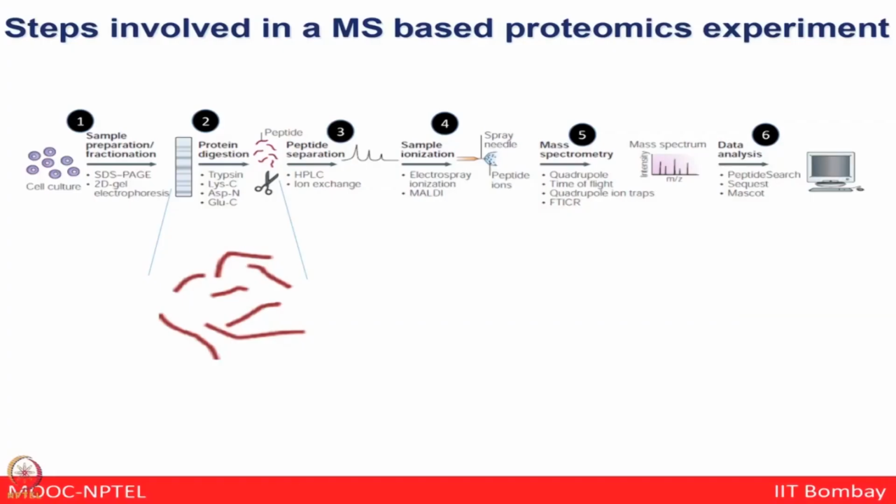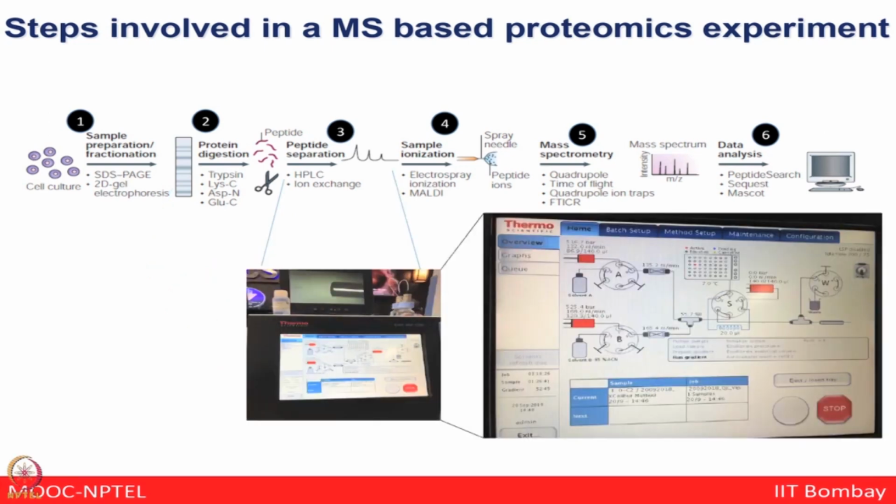You can use various types of enzymes like trypsin, Lys-C, and various other enzymes such as chymotrypsin, which could be helpful to do digestion of these proteins. Of course, doing good protein digestion is very crucial, so you need to use the right conditions for this enzymatic treatment to happen. Once you have done that, you want to separate the complex peptides based on different chromatographic properties, and that is where different HPLC configurations, nano LC based on reverse phase or strong cation exchange chromatography, can be very helpful to separate these complex peptides using some principle of chromatography over the time period.